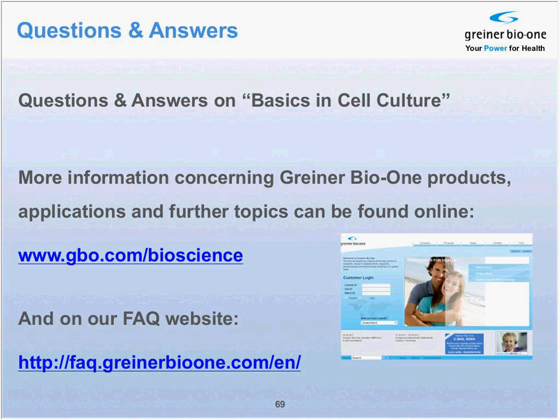Okay. And we've gotten a few questions around this topic. If you could tell people what you use to clean your incubator, or what process do you use to clean your incubator and culture hood? A specific question: is 70% ethanol sufficient to do this cleaning? Well, basically 70% ethanol is completely right.